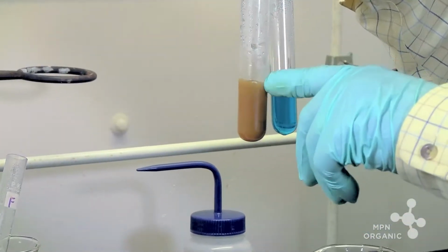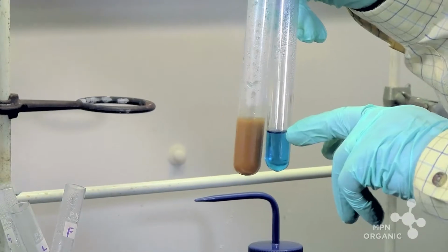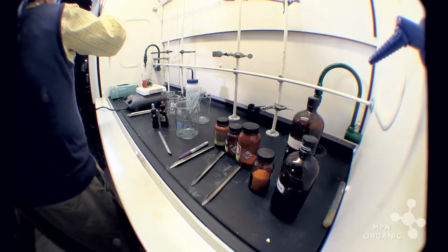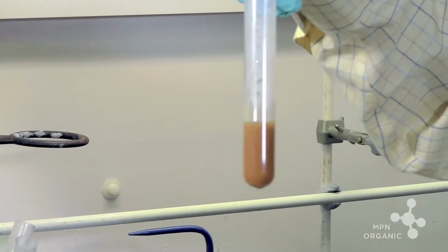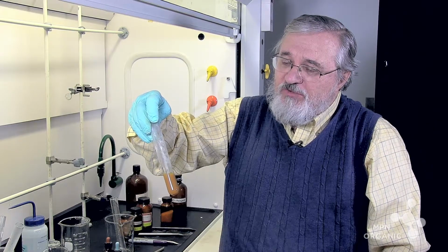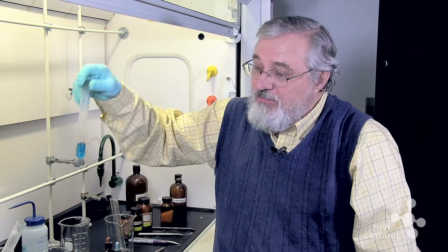So what the sulfuric acid did apparently was to expose an aldehyde group, which this basic solution did not. So I think that demonstrates that sucrose is potentially a reducing sugar, but you have to pre-treat it with sulfuric acid in order to convert it as such. And you can see what happens when you don't. There it is.